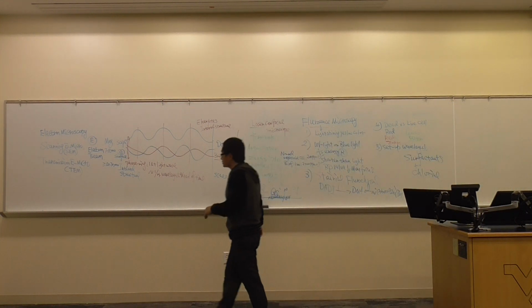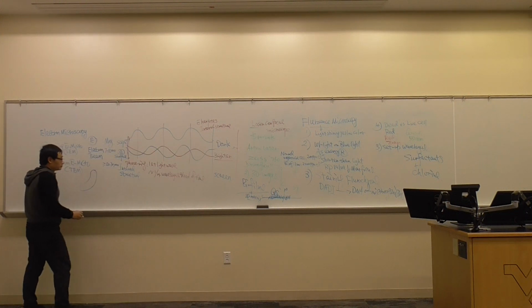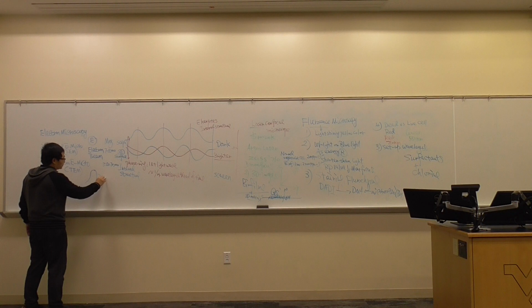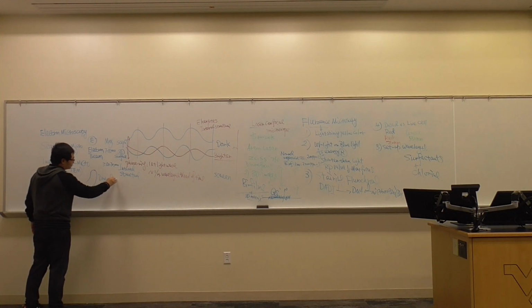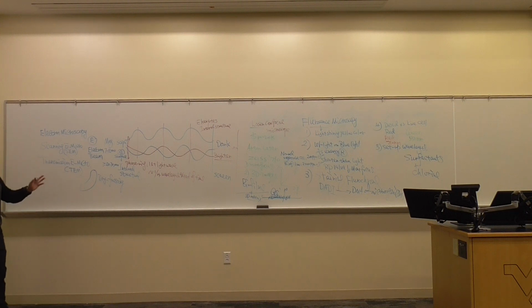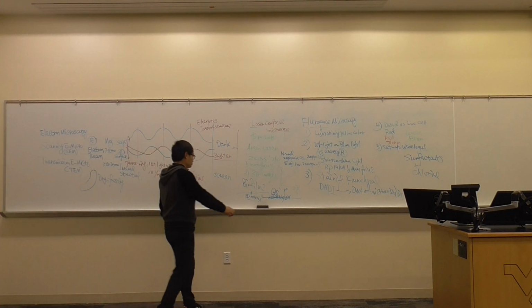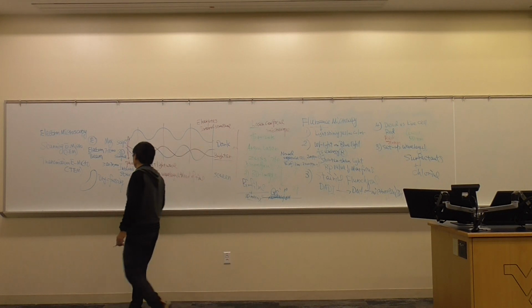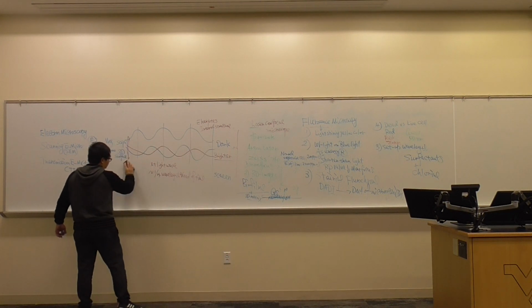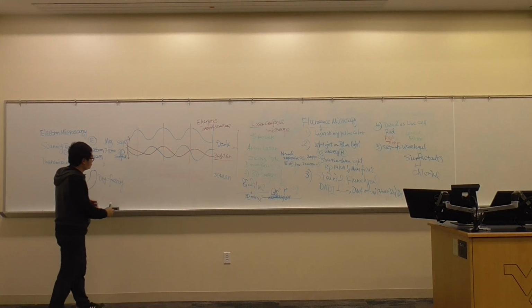The electron microscope needs a sample. Let's say this is a sample. First of all, you need dry freezing. You need to dry freeze it very fast. We could talk about this a little bit. Dry freezing is important. What happens? I'm not sure you understand the chemistry behind it.